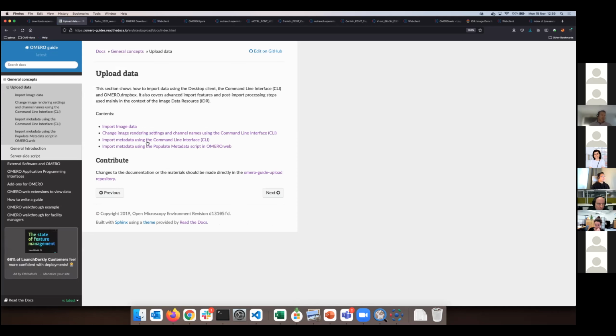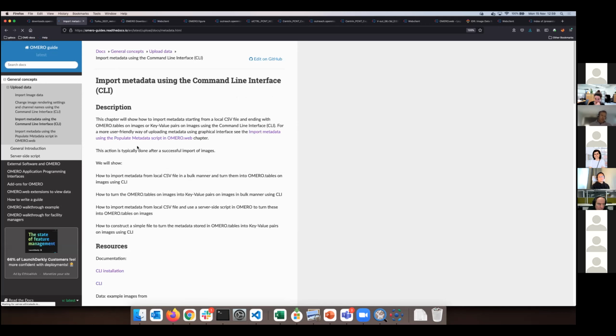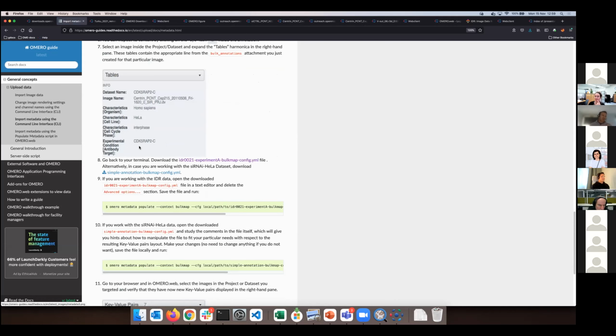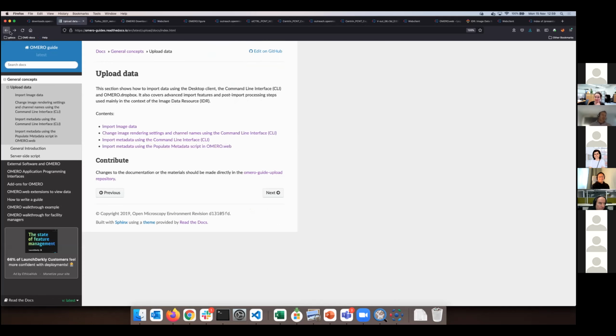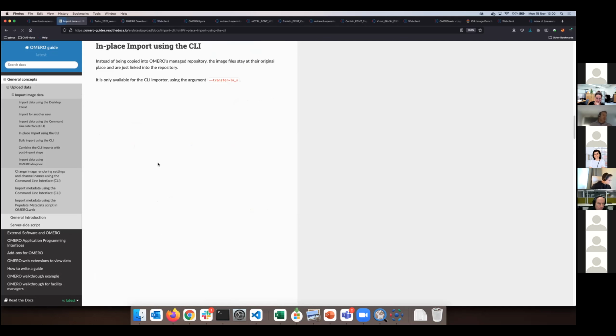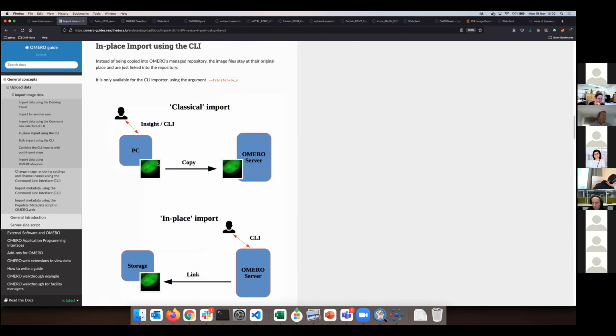There's another mechanism, a system called Dropbox, which is not the known Dropbox. We picked the name before Dropbox became popular, and then we have not changed. It's kind of a bucket into OMERO. When data come, you could imagine some script migrating the good data into that Dropbox area for a given user, and that gets triggered as an import. So the user doesn't have to physically import themselves. There are other options, but none from the web at the moment.